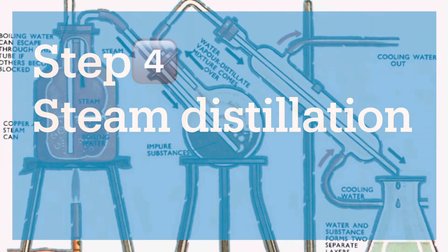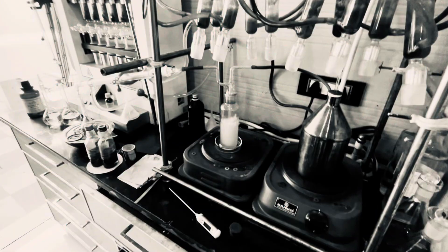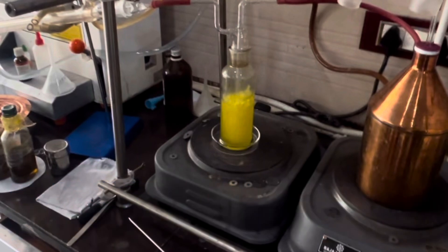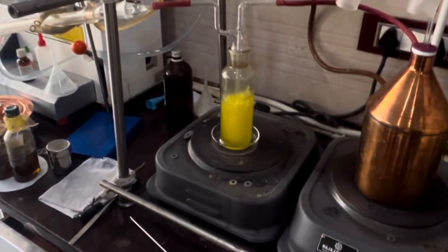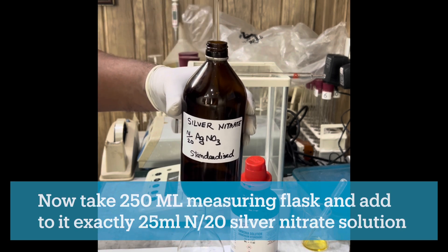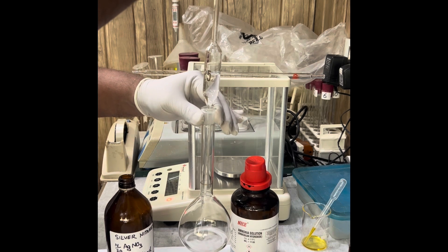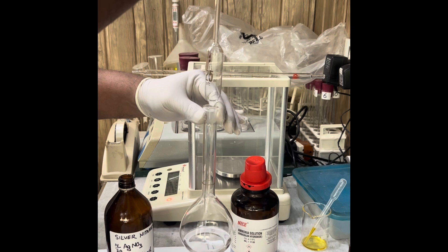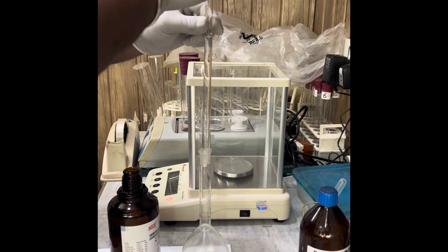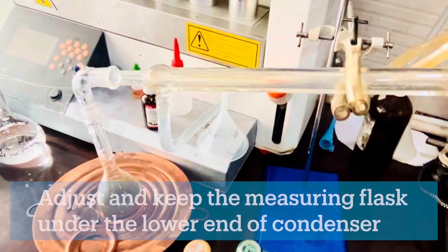In the fourth step, steam distillation, the compound allyl isothiocyanate is separated from the distillation flask and transferred to the receiving flask. We set up the complete distillation unit by connecting the distillation flask on one side with the steam generator and on the other side with the condenser. Take a 250 ml receiving flask and add to it exactly 25 ml of N/20 silver nitrate solution and also add 10 ml of 10% ammonium hydroxide solution. Carefully adjust this receiving flask under the lower end of the condenser.